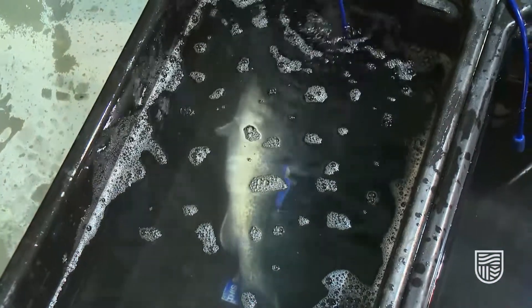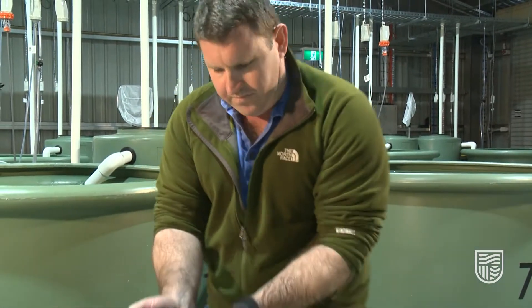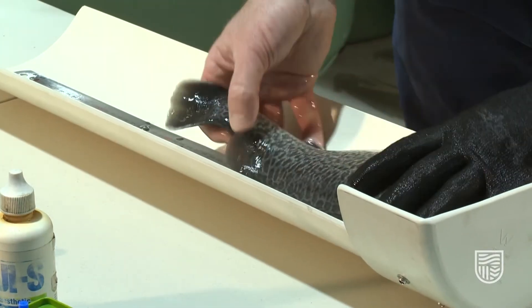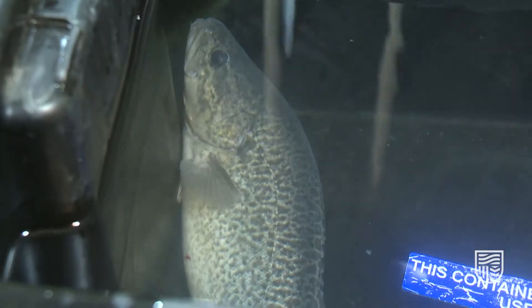Now we'll show you the process for a 23 millimeter tag insertion. The fish is now fully anesthetized in the anesthetic bath. The fish will be removed, measured, the tag will be inserted, we will then scan the fish to make sure the tag has been successfully implanted, and we'll place the fish into the recovery bath afterwards.